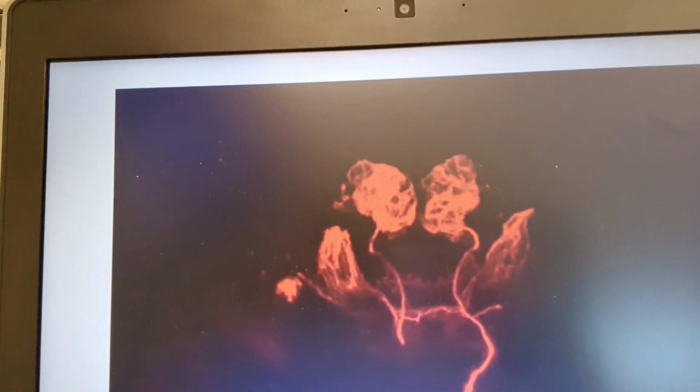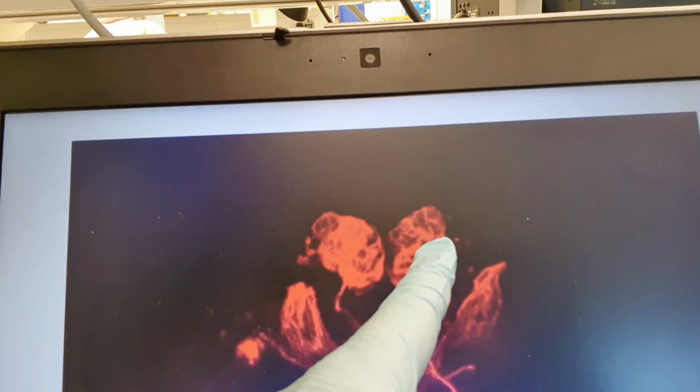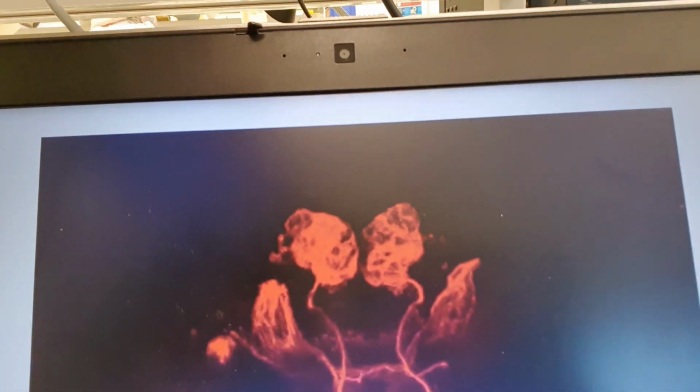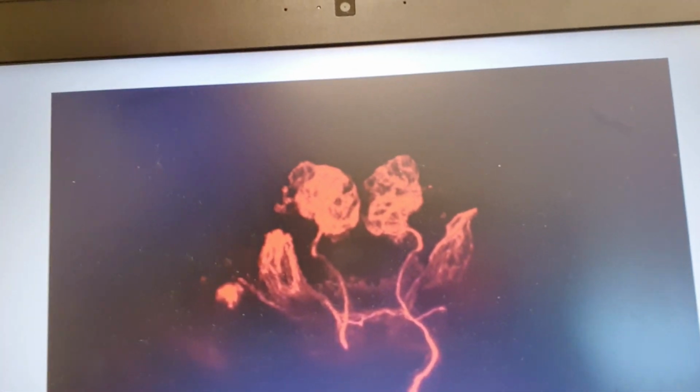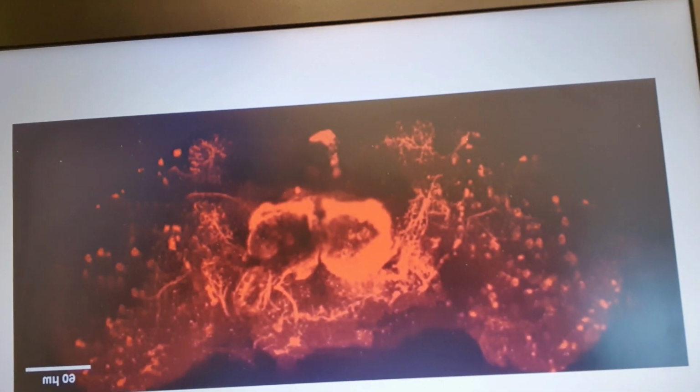This is what it looks like at 0 days with the tau. So this red is our tau with the mCherry fluorophore tagged to it. You can see here we expressed in both these areas. And at 0 days it hasn't moved far from that site of expression. At 14 days you can see there's already a great deal of movement from the tau. It's in these higher order brain regions that are connected up to the area that we expressed the tau from originally, and yeah, there's a great deal of spread.